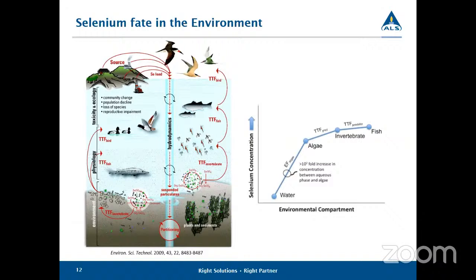Okay, next question. What methods is ALS using to differentiate selenite versus selenate versus organoselenium in biota samples? We're using the HPLC ICP-MS. So that's the method. Okay.